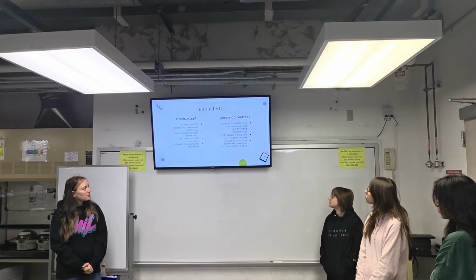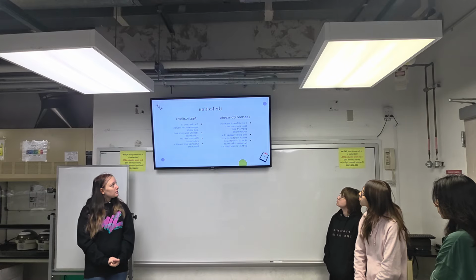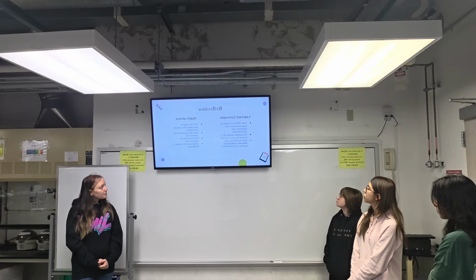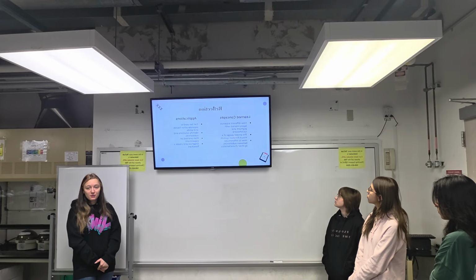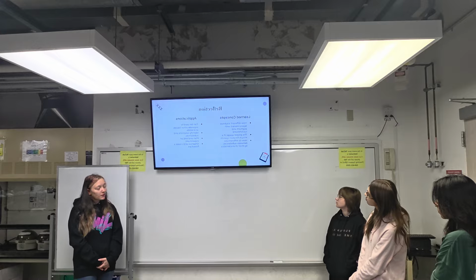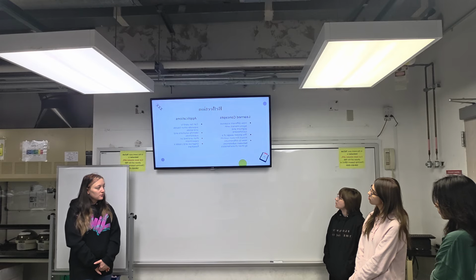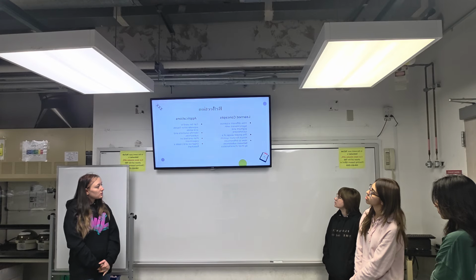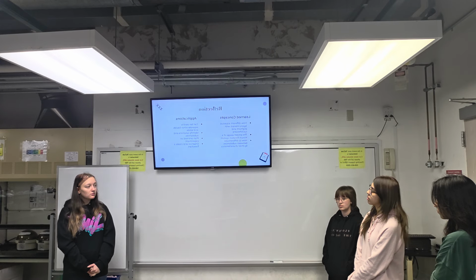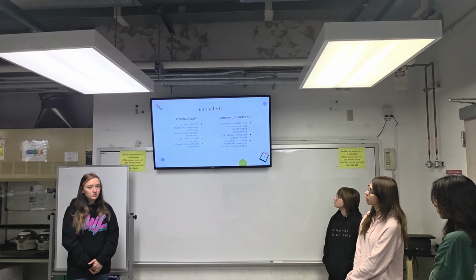So some of our learned concepts, we had how the different aqueous layers will interact with the pigment and cyclohexane, the proper uses of a Hirsch filtration system, and how to differentiate between substances by their characteristics. The applications can be used to separate other liquids and solids. They identify solutions and substances.